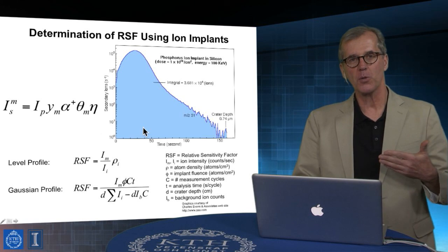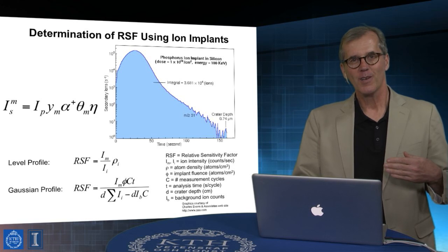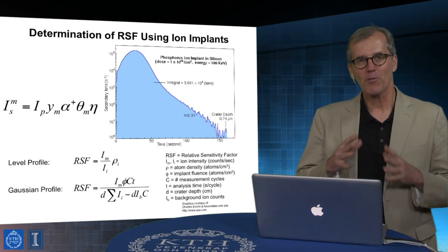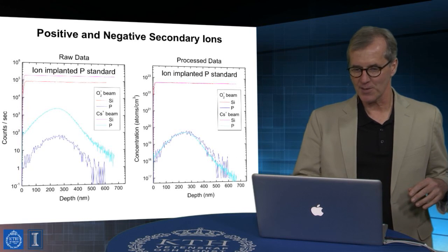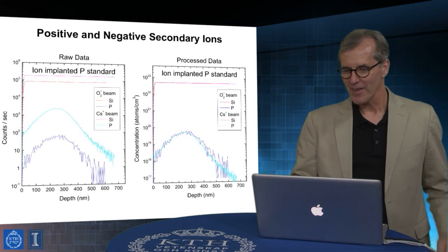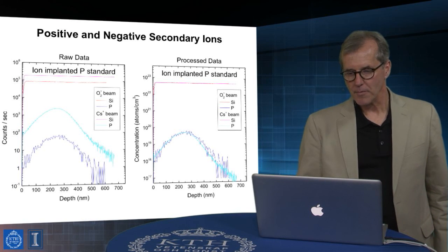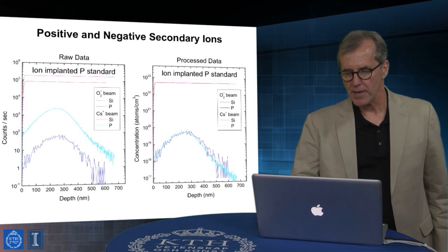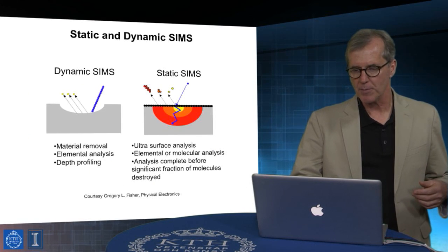And if you're a graduate student, I advise you to talk to your professor about whether or not you're going to spend $10,000 on an analytical standard. Okay, and so this is more or less the quantitative details, and I'll leave that as supplementary material.